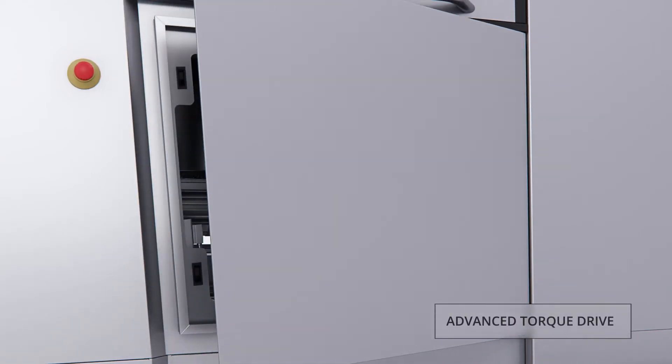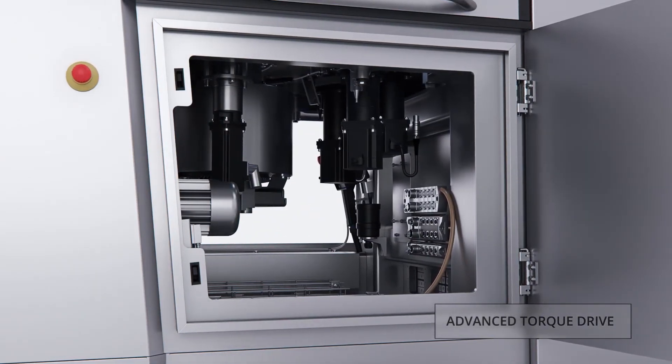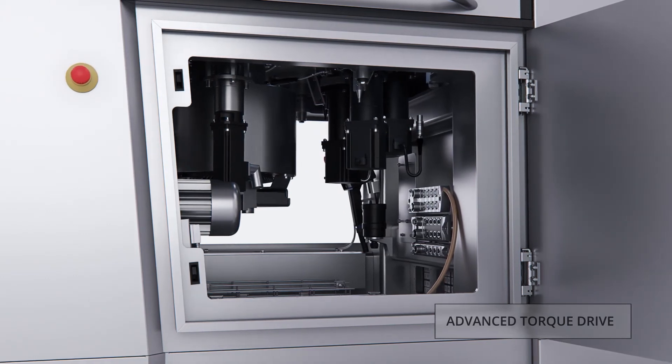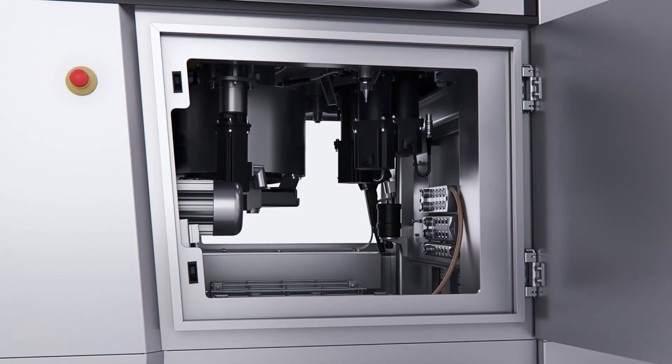A torque drive offers a high power reserve and allows high compression forces even at low speed. The water-cooled chiller serves both the torque drive and the heat exchanger of the electrical cabinet.